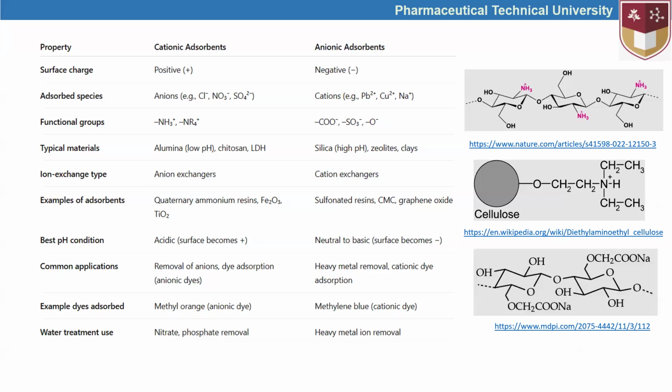If there is charge-dipole interaction, it can also be effectively used to hold those compounds with, let's say, dipole level. Okay, so this is about ion exchange chromatography.